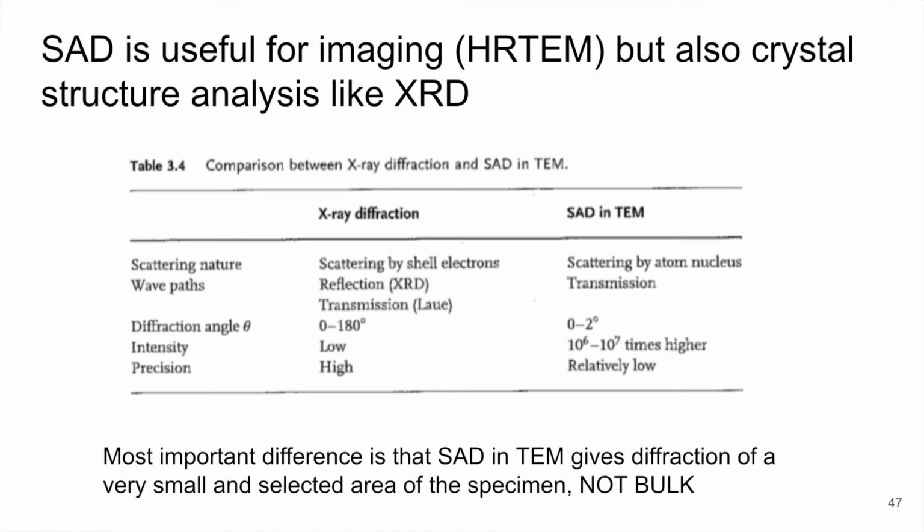However, it's useful on its own because it gives us crystal structure analysis capabilities. Because we're looking at reciprocal space, that tells us about the diffraction. It tells us about the crystal structure of the material.